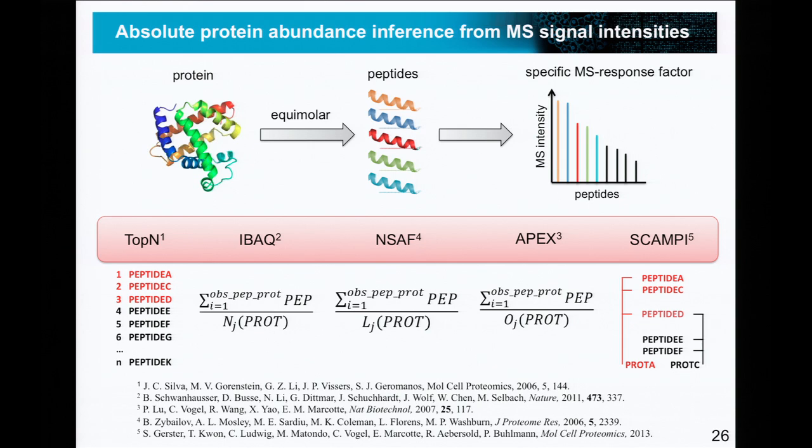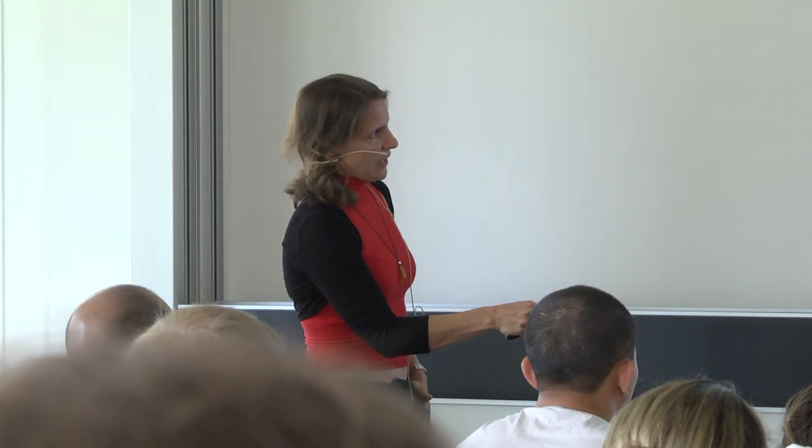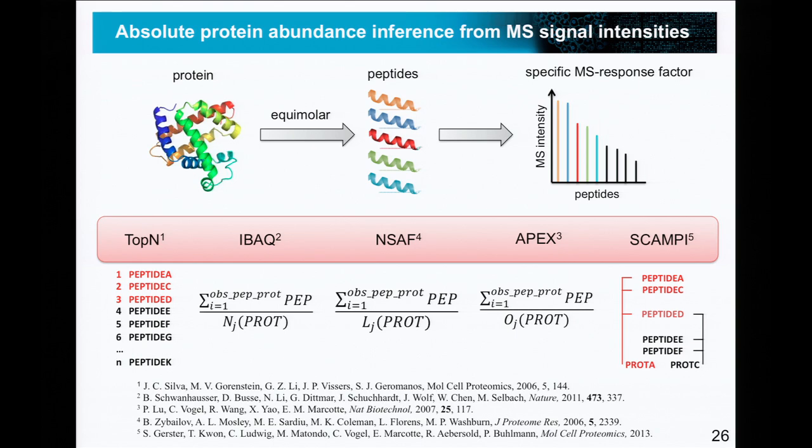So in this approach, there is an algorithm included that can predict how likely it is to see certain peptides and not to see certain peptides. And while all of those approaches usually only work with unique peptides, prototypic peptides, so they simply disregard any shared peptides, this Scampi approach is another statistical approach that was designed to on purpose deal also with these shared peptides.